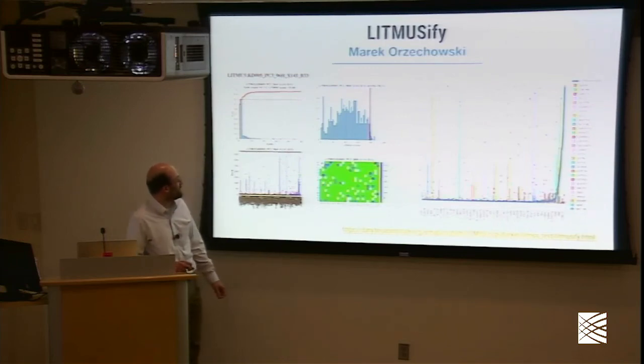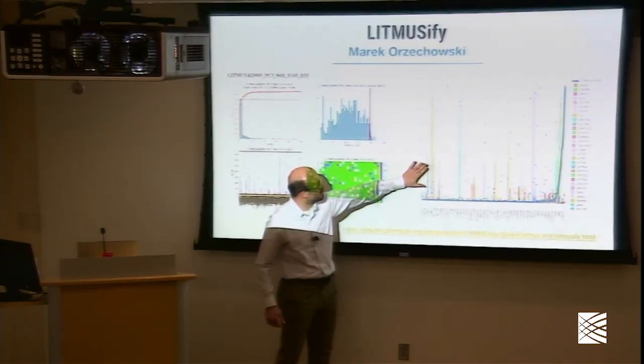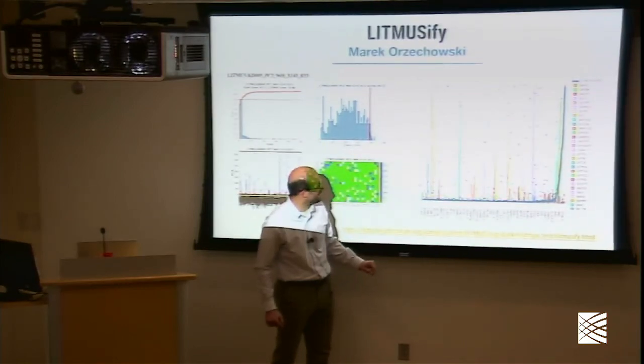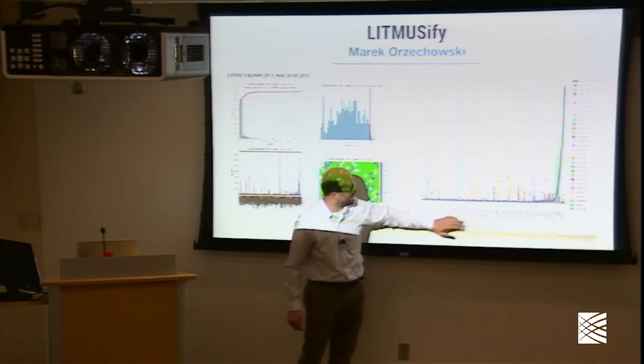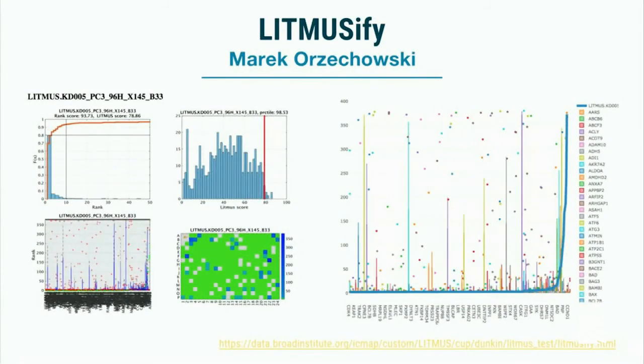We've also added, this is a static image, but we also have a Plotly version of the data, which is a little more interactive, where on the x-axis, we've listed the genes. These are over-plotted, but there's 330 here. We've plotted the genes and we've sorted their rank, and so you can sort of see, if we scaled in here, you'd see these are all rank 1. All of these shRNAs work to knock down their gene. And then we start to get into the tail where things failed. And since it's a Plotly app, we can zoom in and examine those in detail and see if there's anything we need to be concerned with, or if it's sort of just random failures.